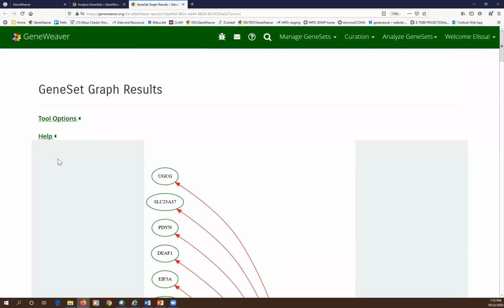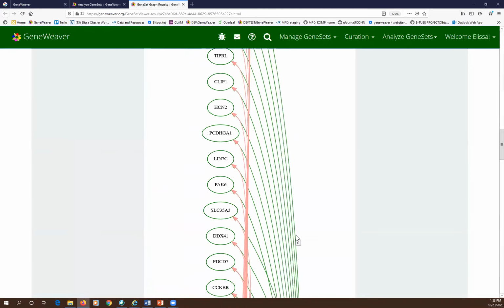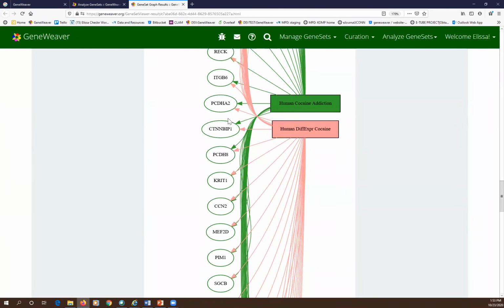But we'll see on this gene set graph. So we're now just drawing the bipartite graph. And I see that there are some genes that are only on this gene list, but I have a large number of genes that are on the pair of gene lists. Now, the more gene lists I add, the more I'll find a small number of genes connected to a large number of gene sets. So, you know, you continue searching for cocaine. I'm not going to attempt to run that live, but those are the types of examples that you can work through using the demos.